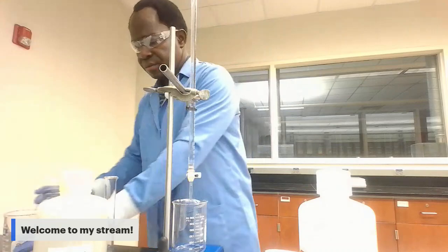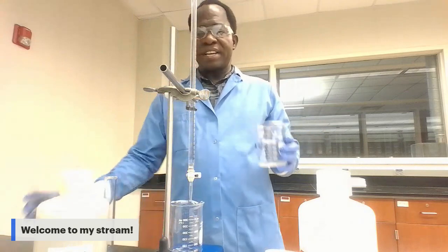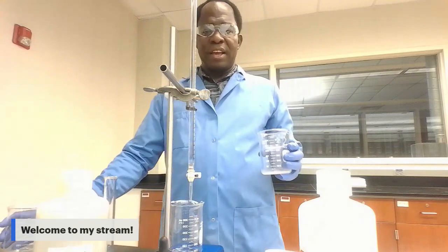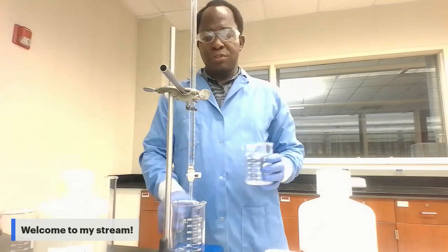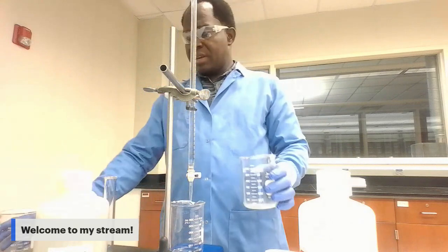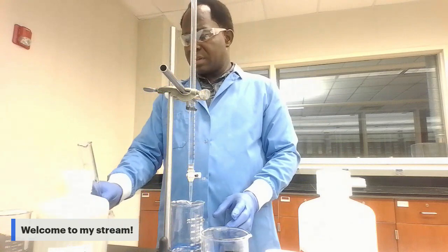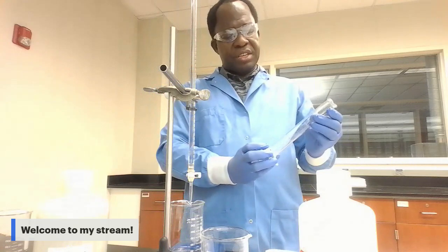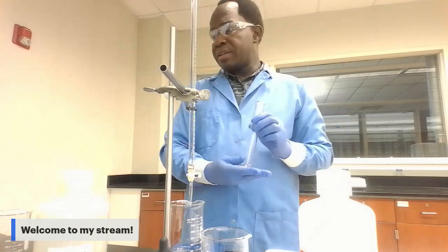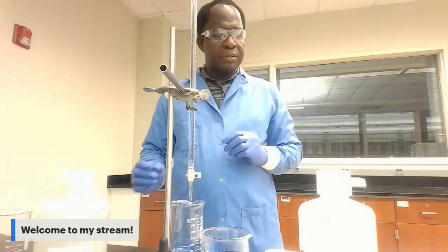Also, you need a 400 milliliter beaker. It doesn't have to be the 400 milliliter; you can also use a 250 milliliter beaker to do this titration. You also need a 50 milliliter graduated cylinder.